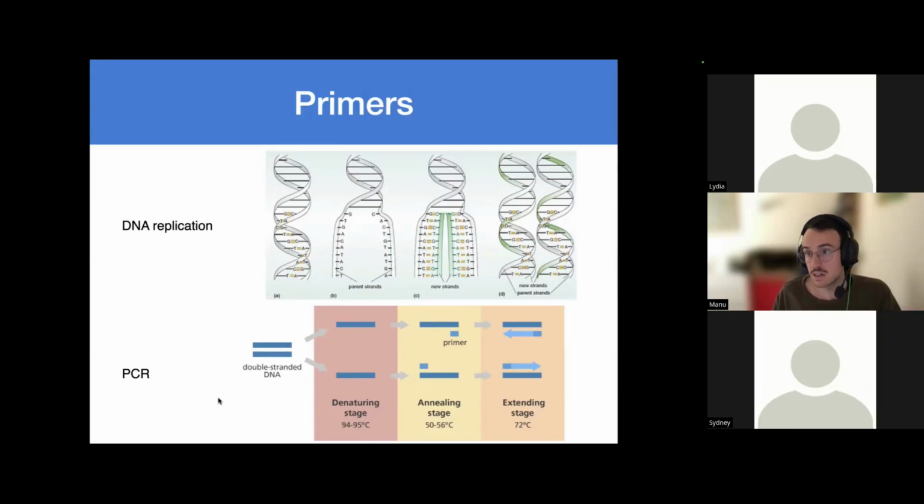So PCR is something that hijacks this mechanism and allows researchers to design short sequences that we call primers to amplify particular subsets of the DNA and then use that for their experiments. This is really important for people who are doing cloning, and there is support for this as well. So we can represent the sequences that researchers have, for example, in a cell line or a microorganism, or as a standalone sequence in a test tube, but also we can represent these primers that they use to take fragments from those sequences.